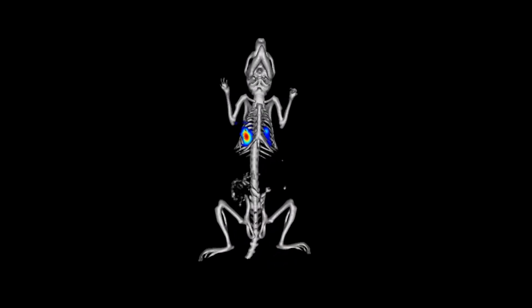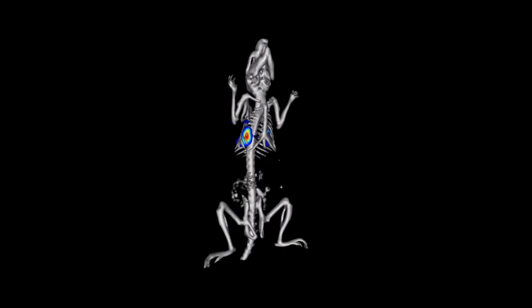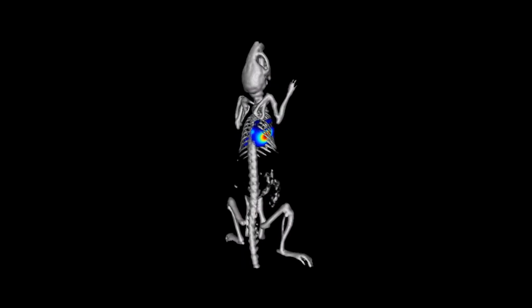Once these preliminary characterization studies are complete, you're now ready to move into the in vivo phase of your work to assess biological activity of your cells in live animals.